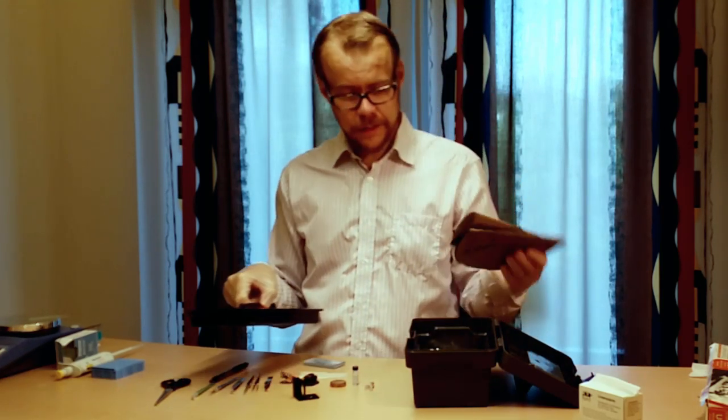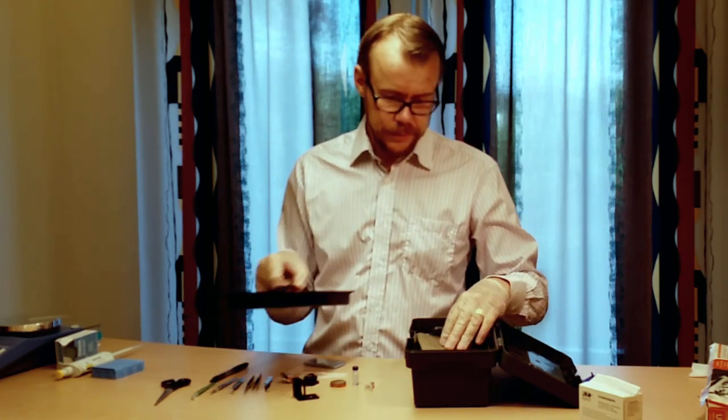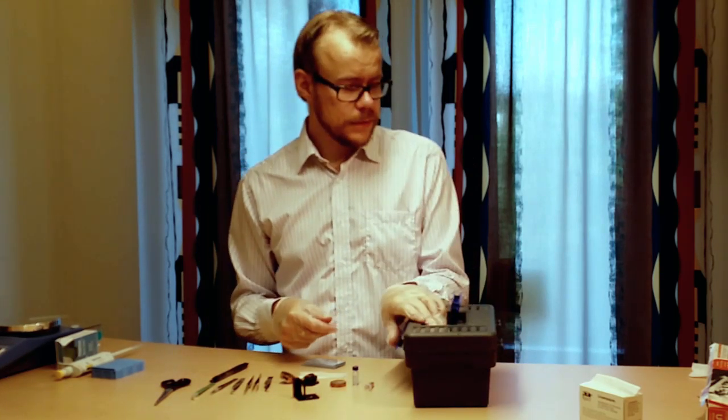The bottom layer I have different kind of sandpaper. Some papers and some extra materials. Some diamond knives. Some pliers and things. So it is very neat to have a box like this.